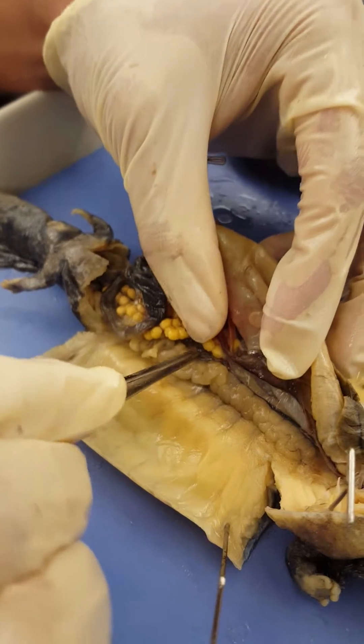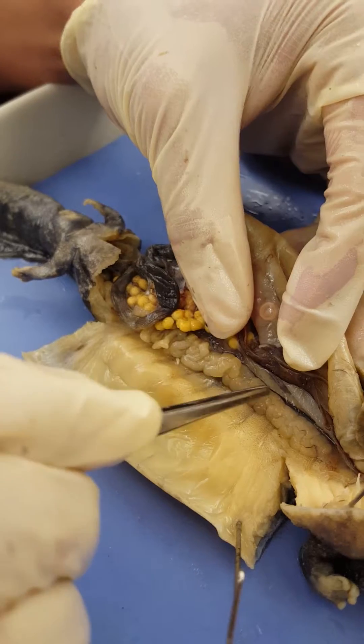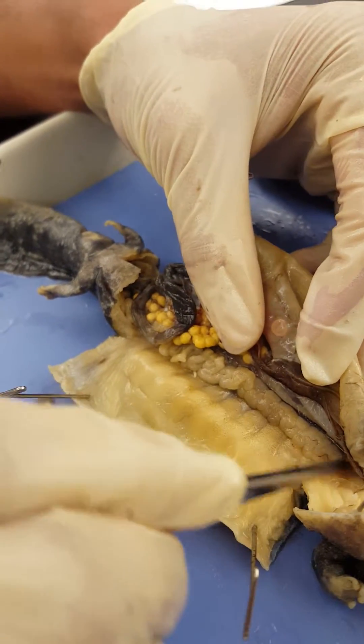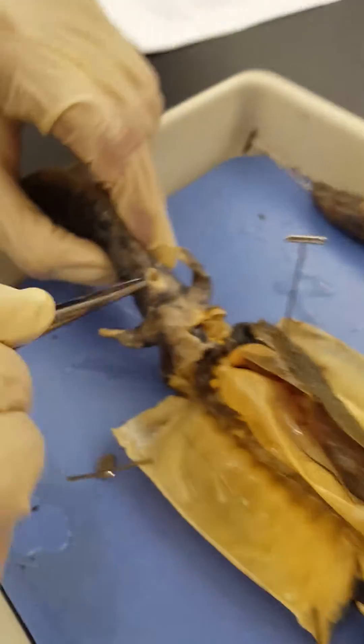Above the ovaries is the kidney. In a male, the kidney is going to have a more distinct opisthonephric duct, which is going to be coiled at the top. And here is the cloaca vent.